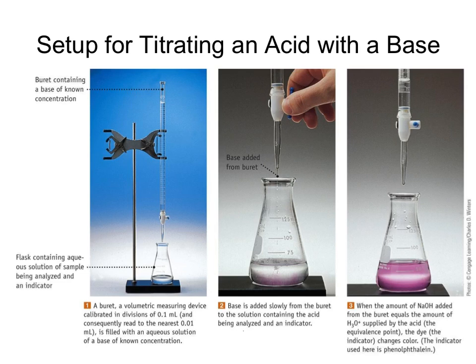These would be the steps if, for instance, we were going to titrate an acid with a base, which is a fairly common titration technique. We use an analytical instrument known as a burette, which is a measuring device usually calibrated in divisions of 1/10 of a milliliter. And so since it's calibrated in divisions of 1/10, we can actually read them to 1/100th of a milliliter.